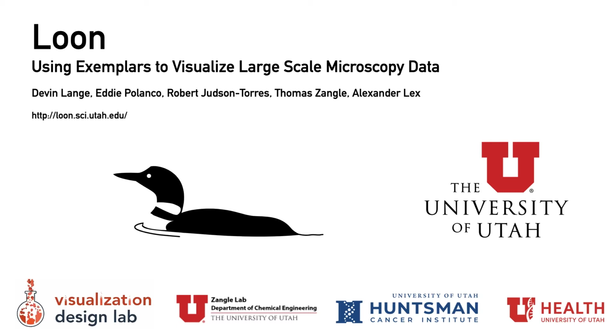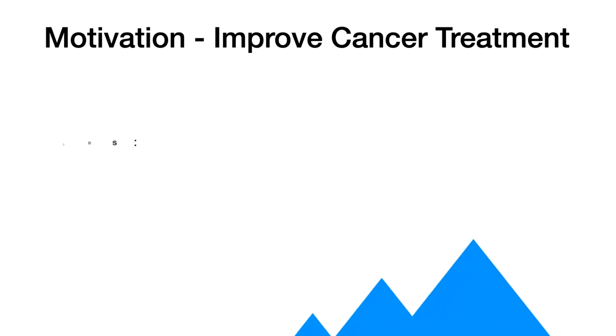Loon is a visualization technique to analyze large-scale microscopy data using exemplar data points. The ultimate goal of our collaborators is to improve cancer treatment. Cancer occurs when cells grow and divide rapidly.